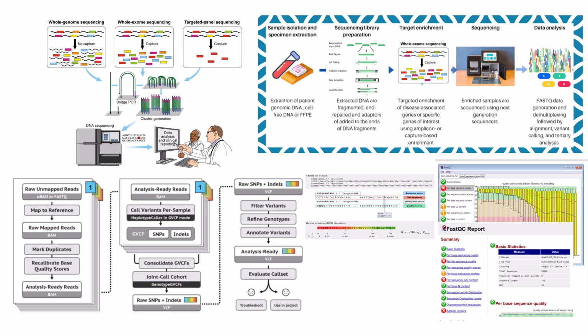So to understand a patient's unique genetic code, you first need context. You absolutely need maps and reference points. Right, like you can't navigate without a map. Precisely. Imagine trying to understand, say, a unique architectural blueprint without knowing the standard building codes or even having a map of the area. It wouldn't work. Makes sense. So phase one is all about setting the stage. It's about gathering these essential reference libraries.